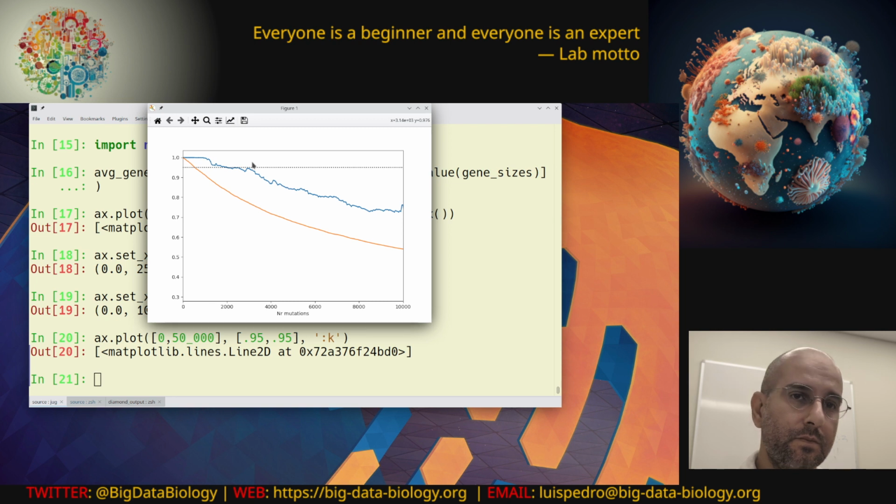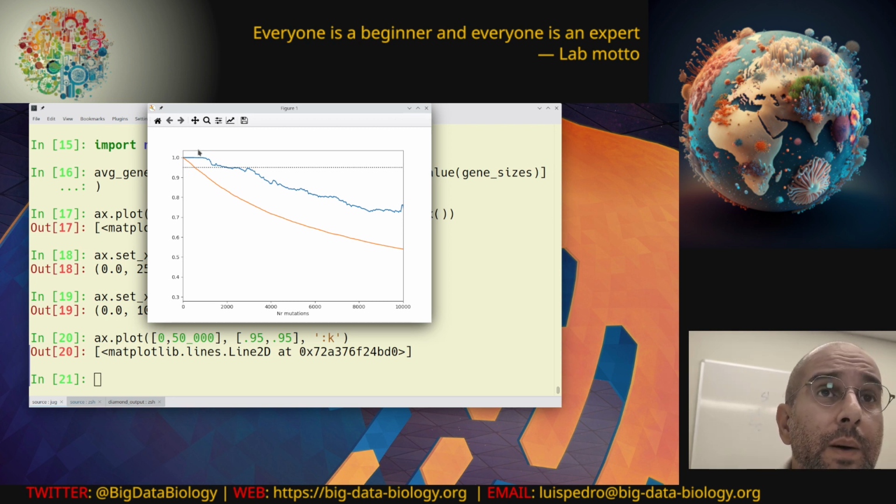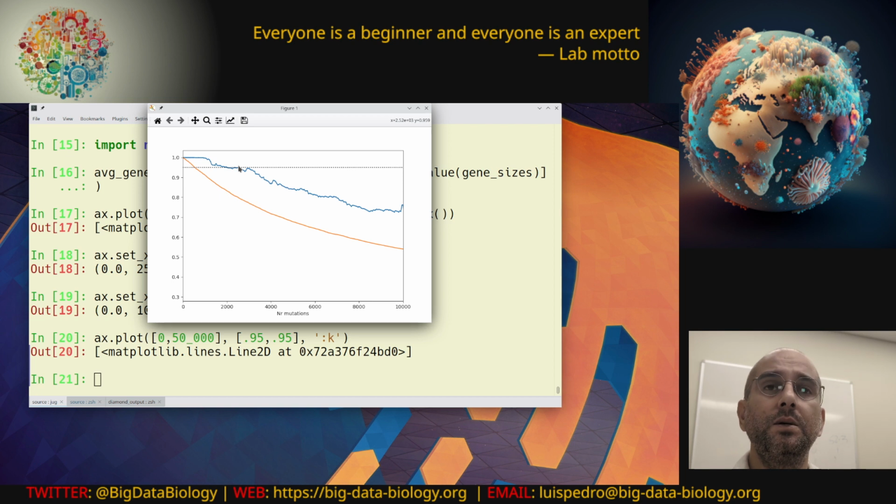Right. So this is nice to see. I mean, this blue plot is the original effect that we saw in our real data: as we had more indels, we were seeing that CheckM2 was reporting lower completeness scores, even though the size of the genomes really hasn't changed.